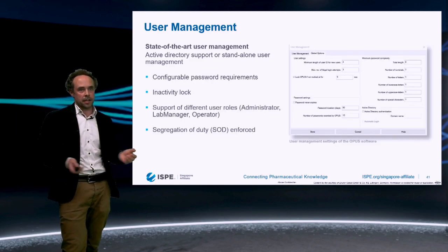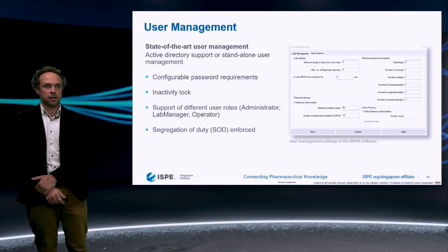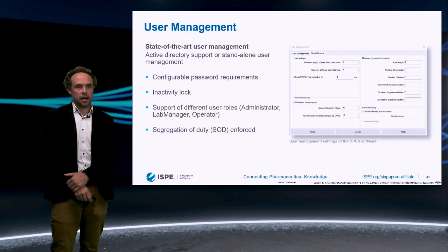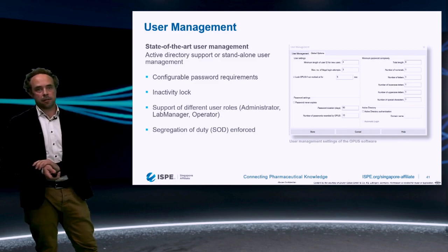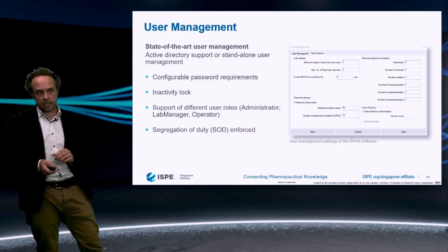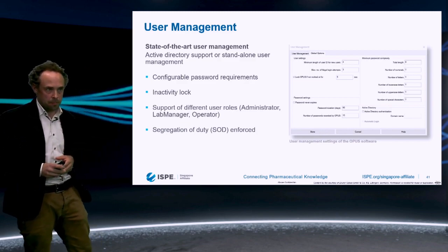Of course, for a standalone user management, there's a little bit more to consider, so that a software fulfills all these configurable password requirements, like, for example, the maximum number of invalid login attempts, password complexity requirements, and password expiration. Of course, inactivity lock is as well important.